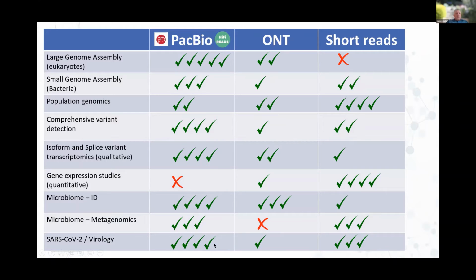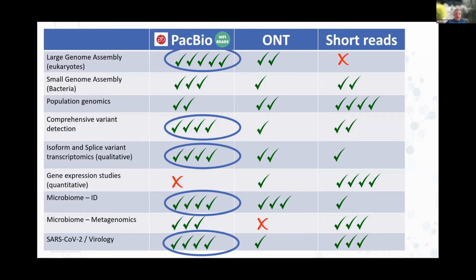So this is where PacBio has a real strength in their probe-based technology that they've released for their assay, and also the long reads that allow phasing and understanding of quasi-species within an infection as well. So you can see in real time the variation that's happening.